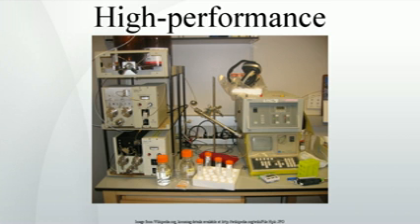Aqueous normal phase chromatography. Aqueous normal phase chromatography, ANP, is a chromatographic technique which encompasses the mobile phase region between reversed phase chromatography, RP, and organic normal phase chromatography, ONP. This technique is used to achieve unique selectivity for hydrophilic compounds, showing normal phase elution using reversed phase solvents.